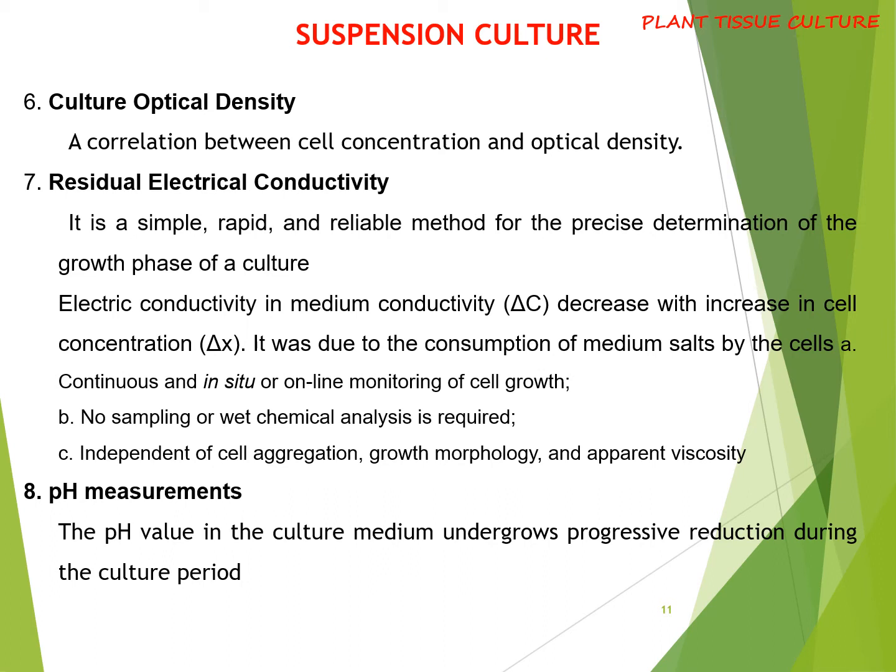The optical density of the culture media increases with cell concentration. Certain probes are used to estimate the optical density of the suspension media to estimate the growth kinetics.